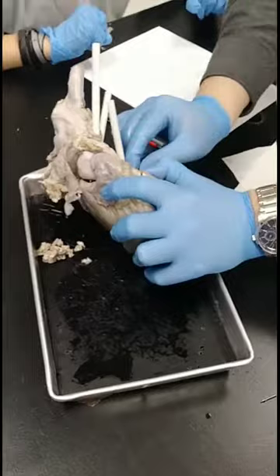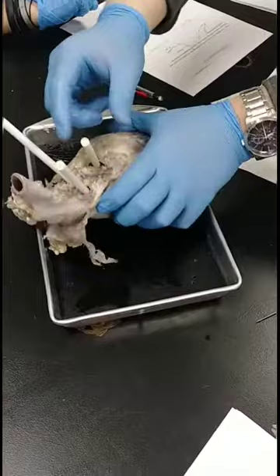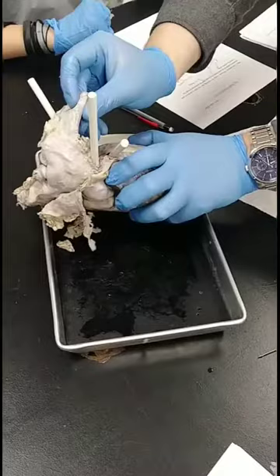Make sense? So this is your anterior side, this is your posterior side, and that's the vena cava right there going into the heart. It's very thin compared to the aorta trunk up here, right?